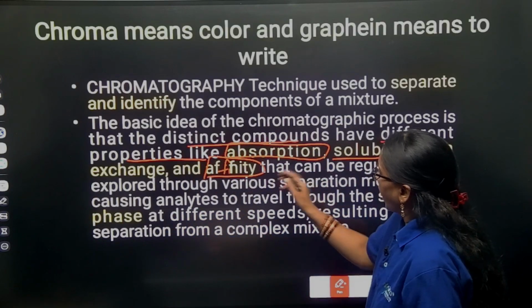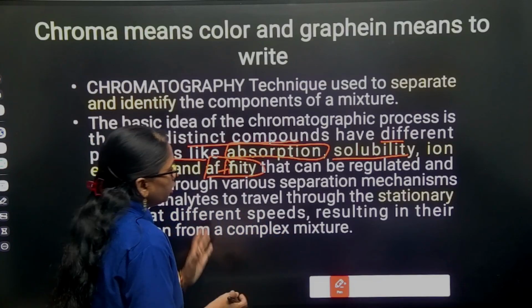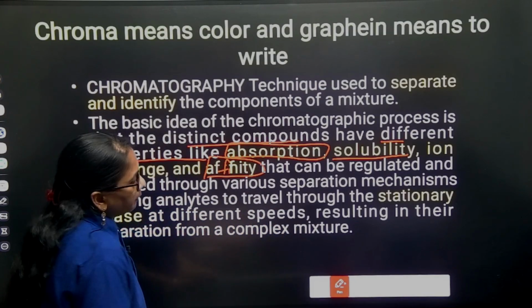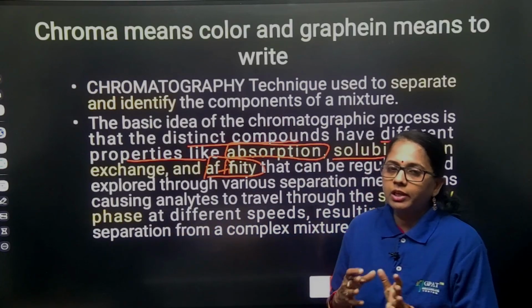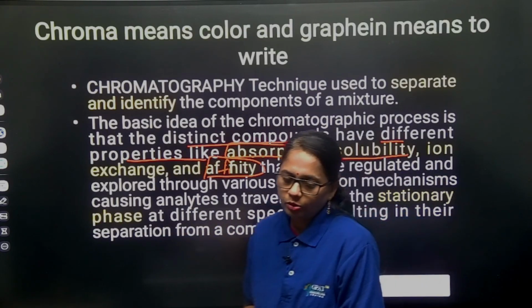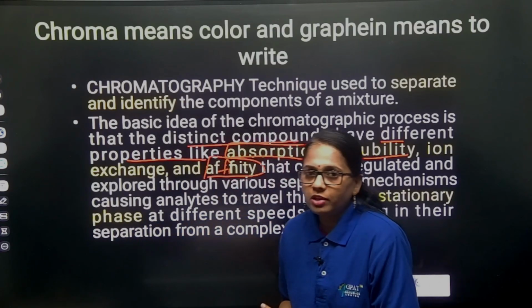Absorption, partition and solubility are the most important terms, along with whatever mechanism we use. Ultimately our aim is to separate the mixture of components.